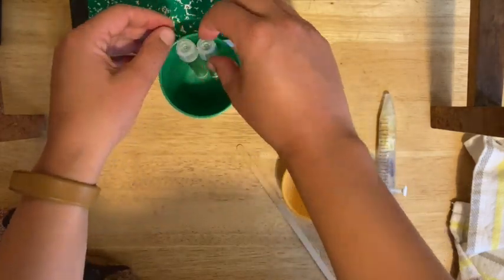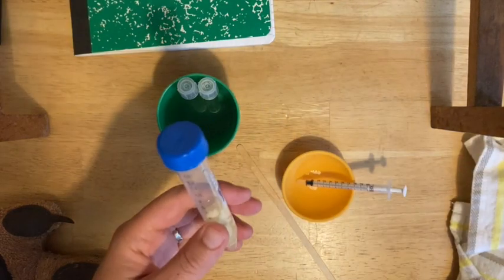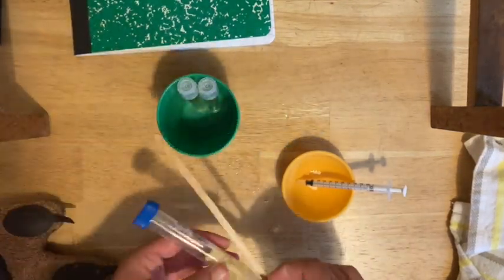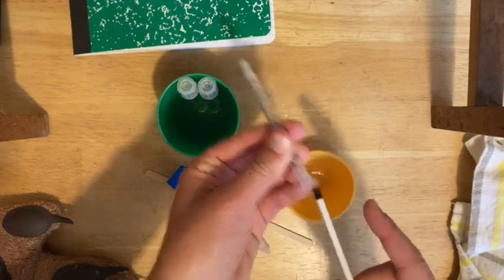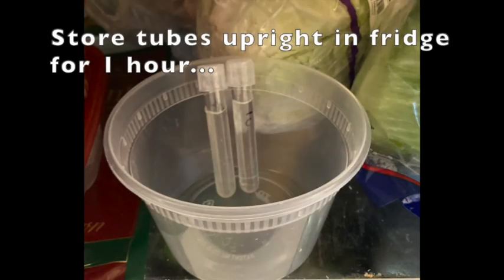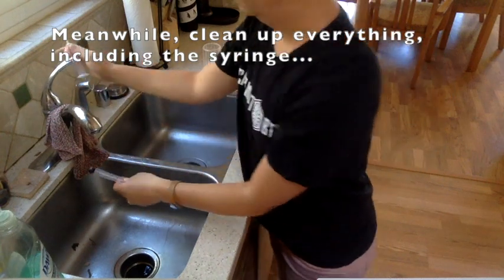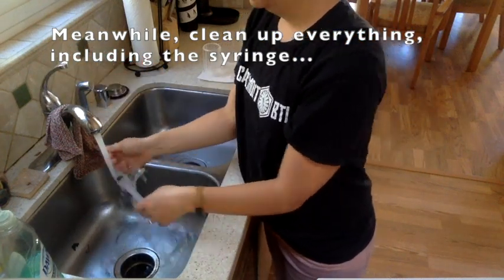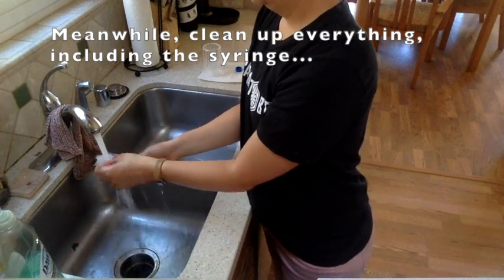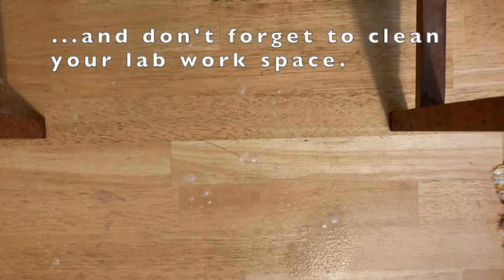These two tubes you want to put into the refrigerator for at least an hour, and then check them. Everything else should be cleaned and thrown away — the tube and wooden stir stick can be thrown out. Rinse the syringe thoroughly, or run it through the dishwasher to get rid of any sticky sweet residue. Place the tubes upright in your refrigerator for one hour and set a timer. While waiting, clean everything else up. Separate the syringe into two pieces and rinse well. Consider putting everything in the dishwasher on the top rack. Also clean your lab workspace as it may be sticky.